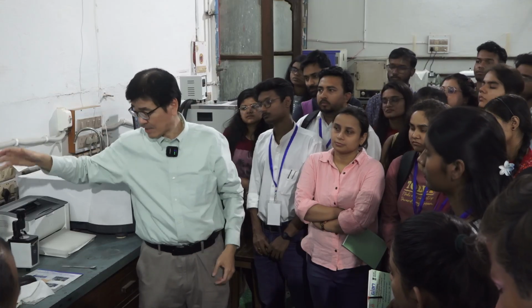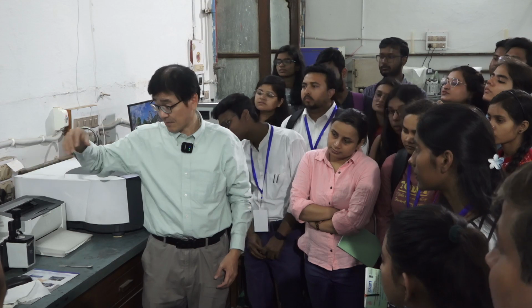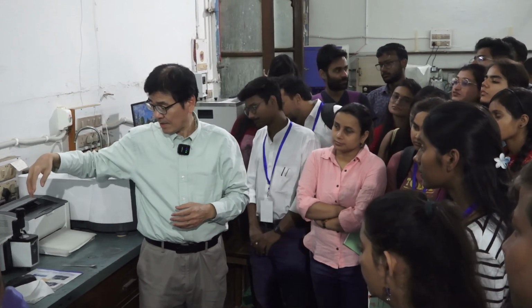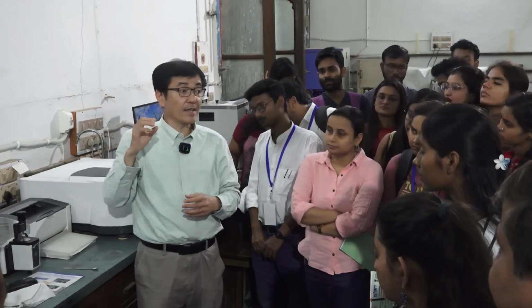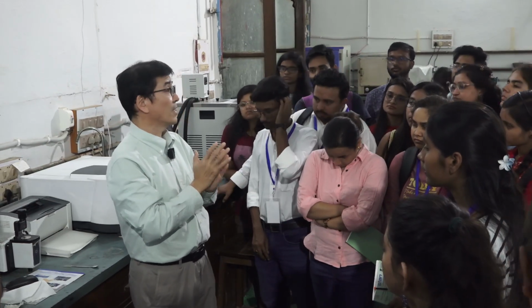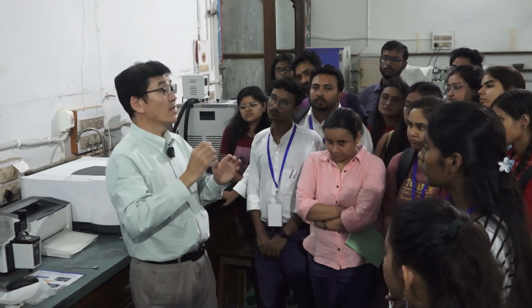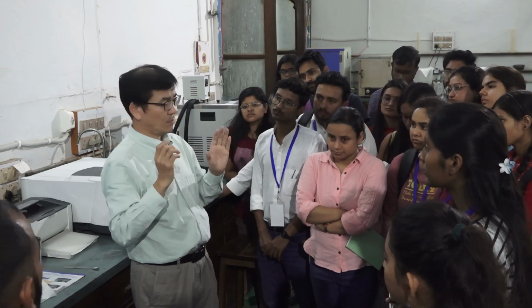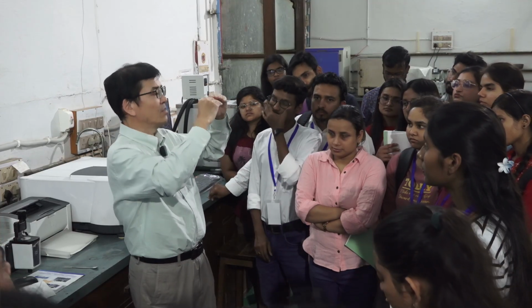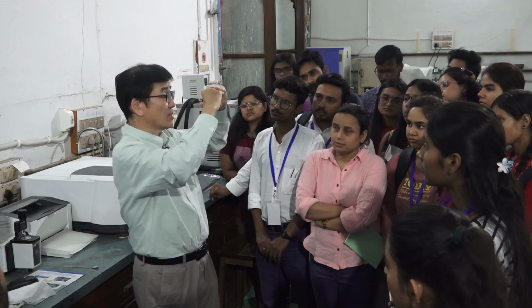Today, here is the IR spectrometer, and this is a little bit different configuration. We can choose ATR IR absorption. ATR is attenuated total reflection. For this experiment, we use a germanium prism, Ge prism.